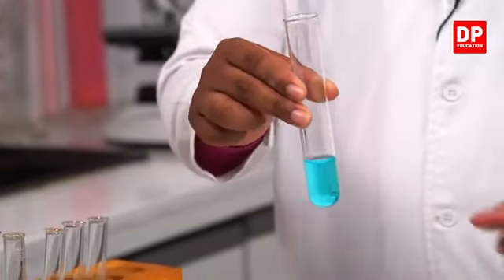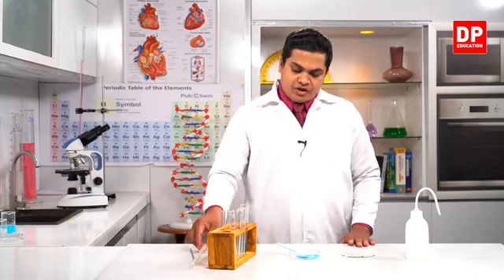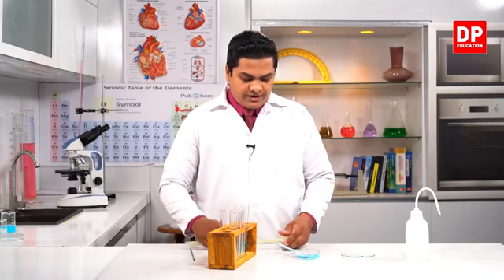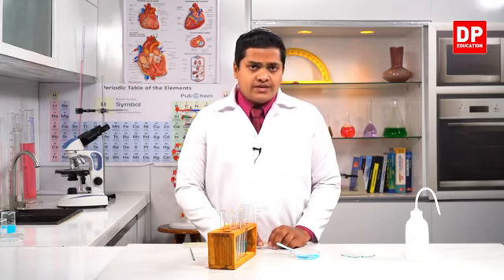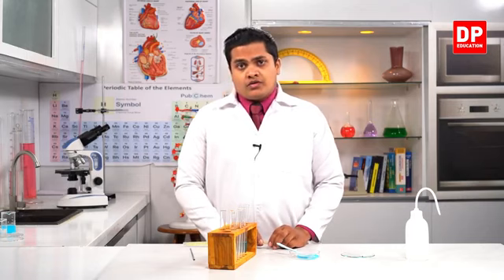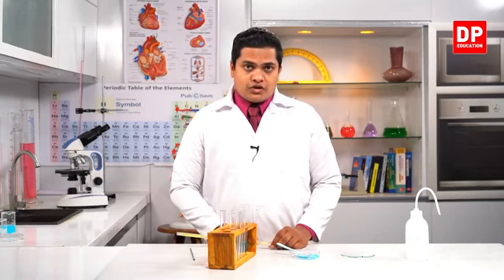Right, so now I'm going to place it over here, and we will measure the temperature of the copper sulfate solution. We need the temperature measurement in order to check whether there is a heat change, or whether there is a temperature change in the system during a chemical change or not. To observe it quite well, I'm going to use this thermometer and measure the initial temperature of the copper sulfate solution.